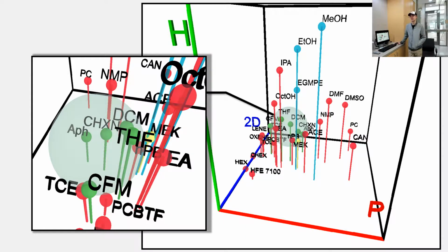Did you ever try the death solvent? The death solvent. Now it's on tape. We have a mixture of NPB and TCE that we accidentally made by taking one of them out of the degreaser and putting them into the other container. So we have this blend of NPB and TCE that might clean the Sharpie. I tried it. It didn't do anything. Okay, so then it must be below the sphere too much to clean. Yeah. You would think it would.